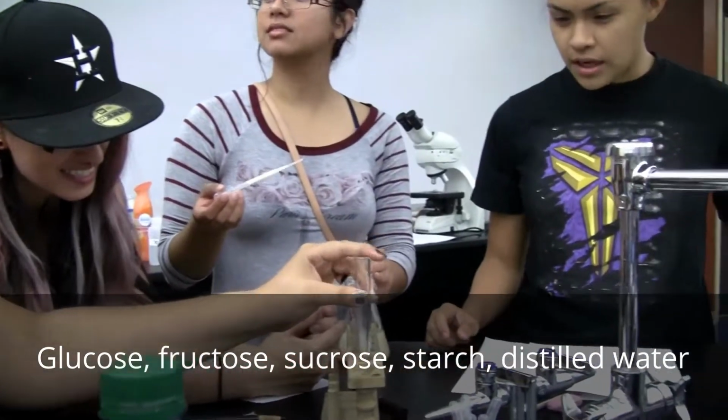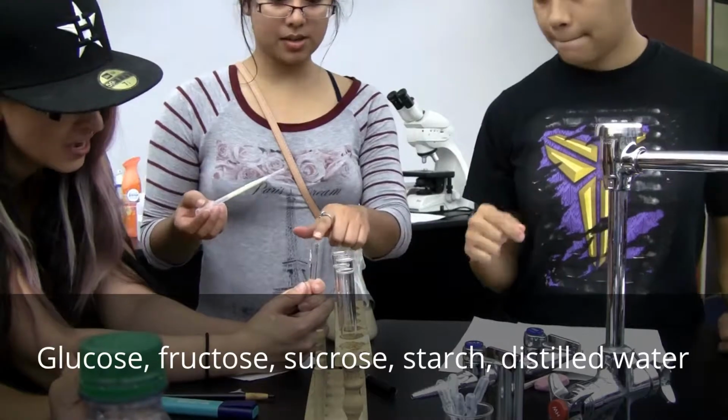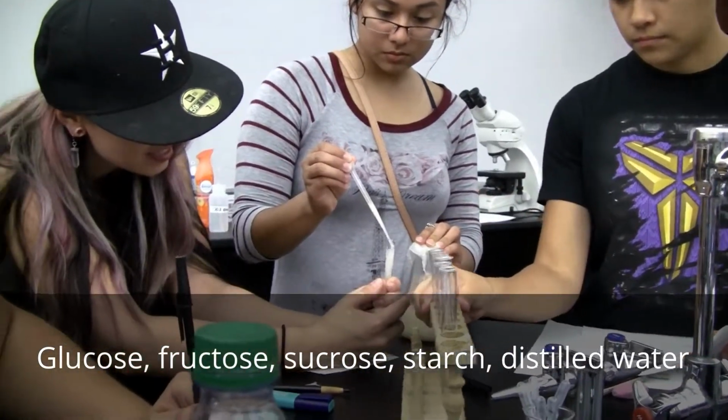Right now, when we're done adding these, we're going to measure and record the height of the bubble from the top. Don't add any to that one? Yeah. I have a little ruler down here. This is the distilled water one. Yes. Sorry, Brenda. It's okay.